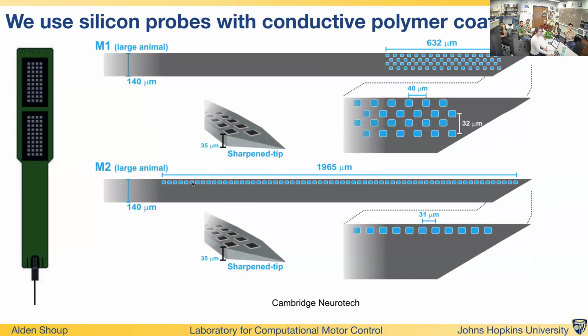There's also, if you want to record more depth, if you want a better idea of your structure going into the brain, a linear probe, and these have one strand of contacts down a larger span. Now, the probes that we use have 64 contacts. You can buy probes with more, but it's bottlenecked because they're passive probes.